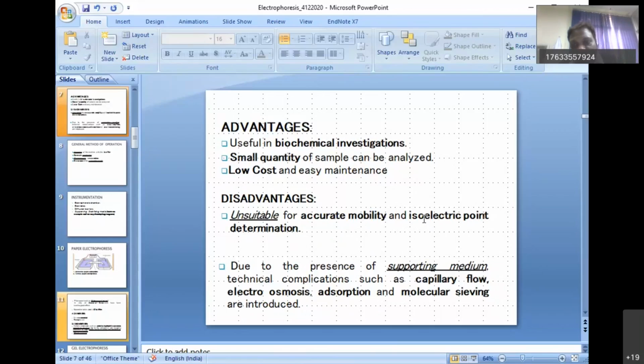Isoelectric point is basically the pH of the solution where the protein has no net charge when we move it. So the net charge becomes zero. Because it is related to the pH, when proteins move depending on the pH in a solution and reach that point, the separation of the protein molecules stops. On the basis of that, you can also do separations.